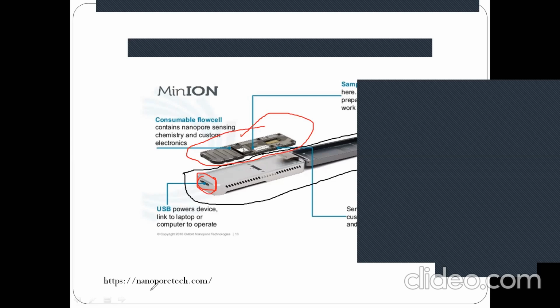But till date, what the manufacturer says is that they have only achieved around 80% accuracy. So PacBio is better, with higher accuracy, but if you don't have 10 lakhs in your grant budget, that is a huge amount of cost.